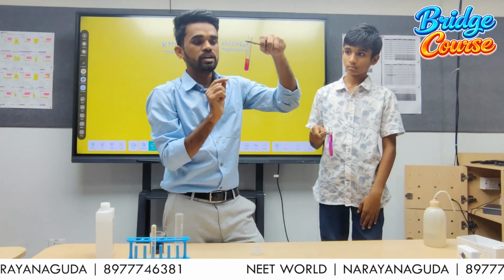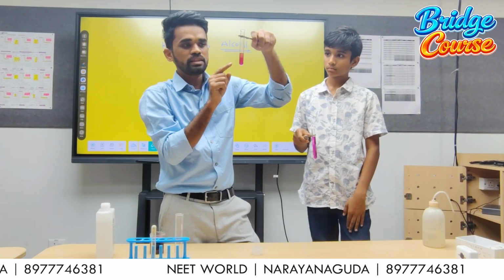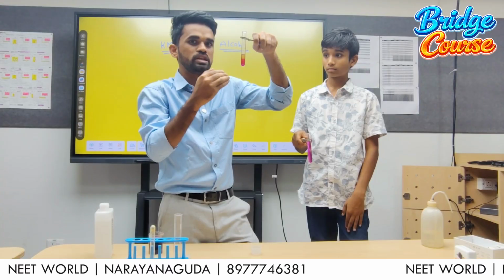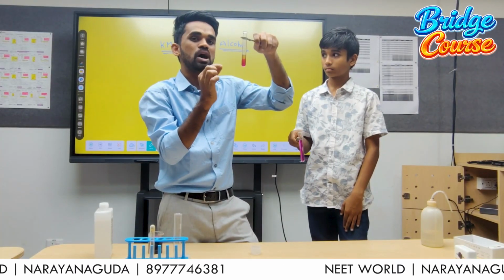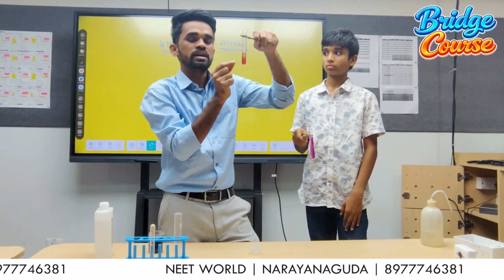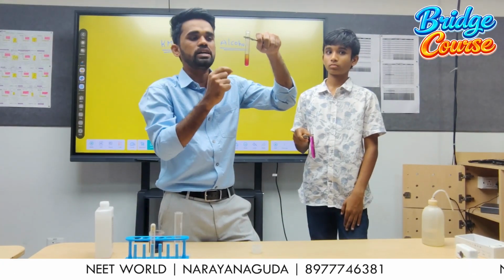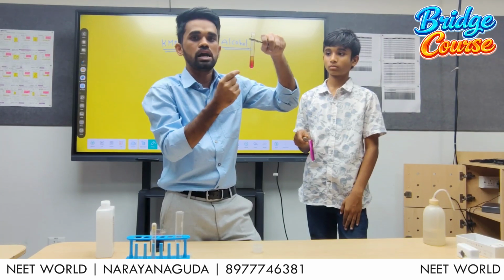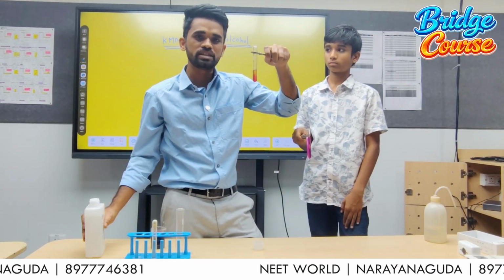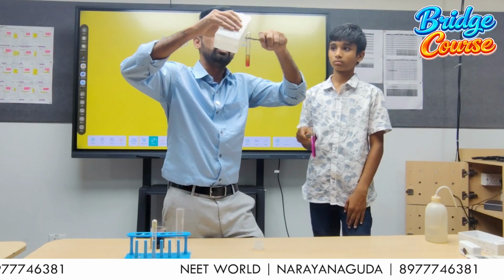Yeah, so now here you can observe slowly that the pink color gets faded out. If you want to observe this more quickly, you can add a small amount of acid also, so that the KMnO₄ color disappears quickly. Or you can take an extra amount of alcohol also, it disappears. Let's add a little more ethyl alcohol to this so that it completely fades out.